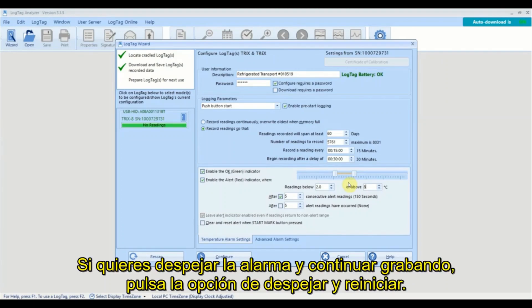If you want to clear the alarm and continue recording, tick the clear and reset option here.